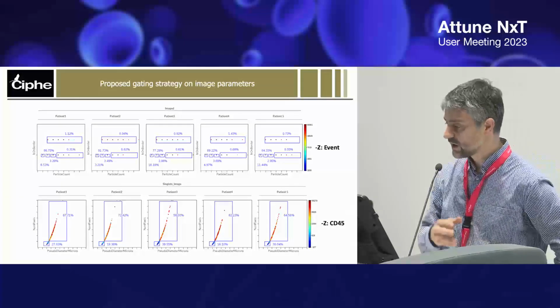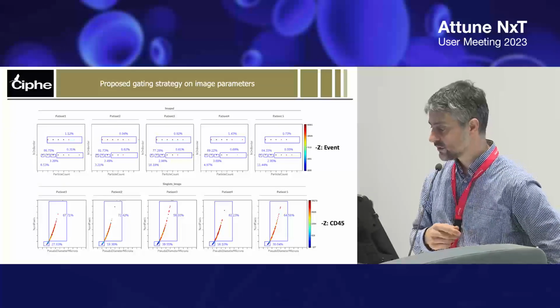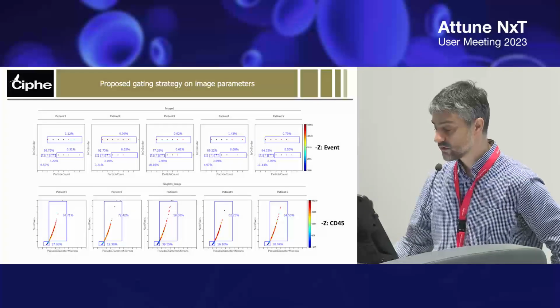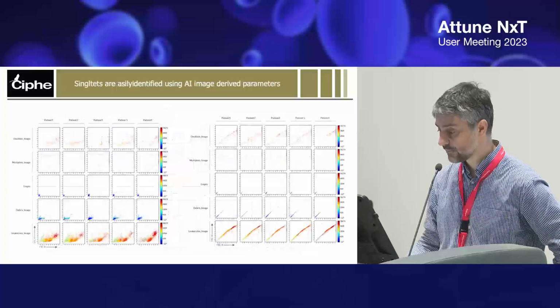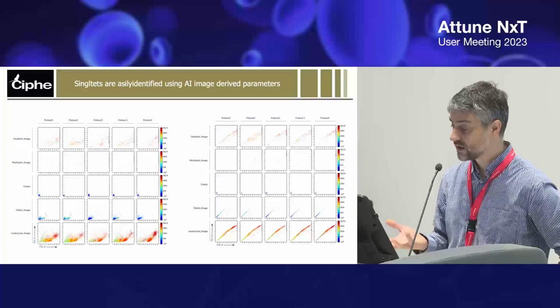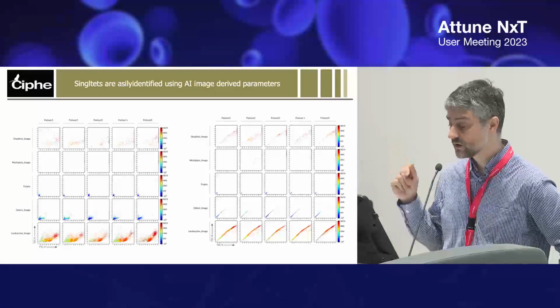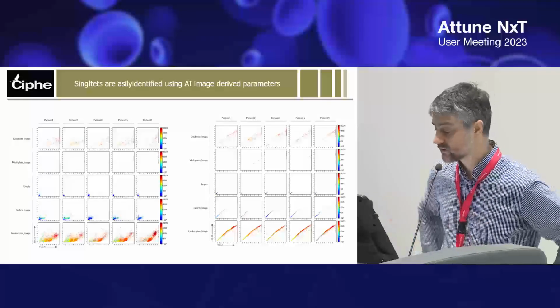Now if I look at my different patient samples, that's how it looks. I can do statistics, obviously. I have my percentages. All of this is on images, so just cells that were captured by the microscope, and I have my percentage of CD45 cells. Then what I can do in an agnostic manner is look at my plots. I'm projecting each image parameter as a Z, in color code, onto forward scatter and side scatter to appreciate what's going on there.